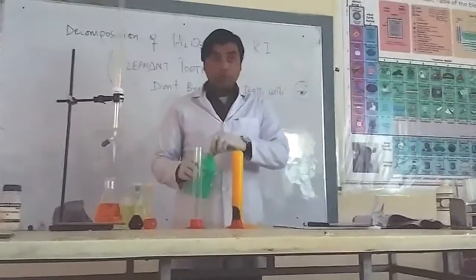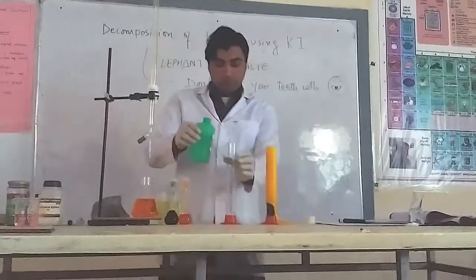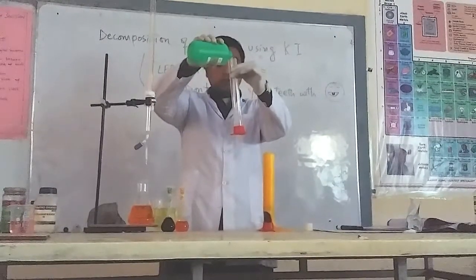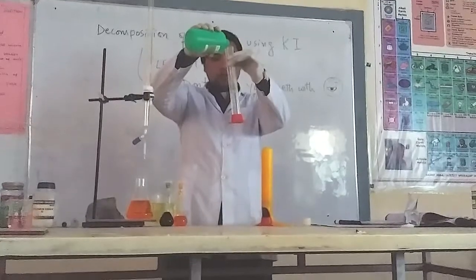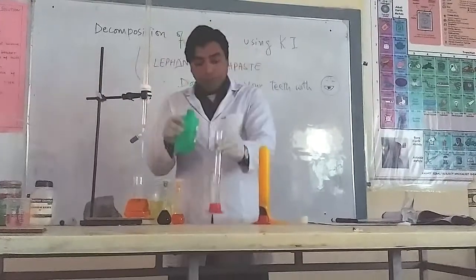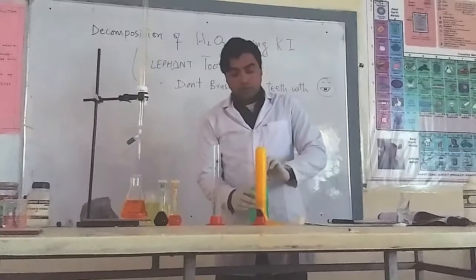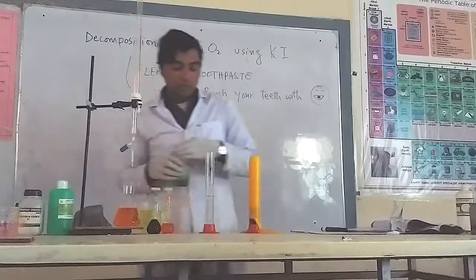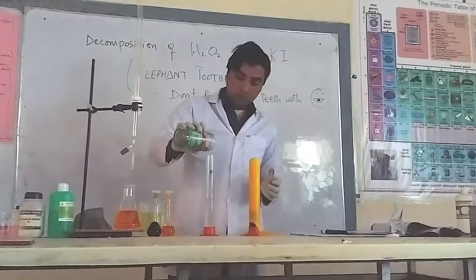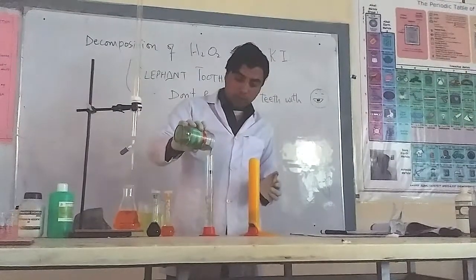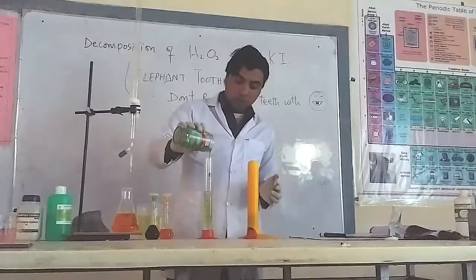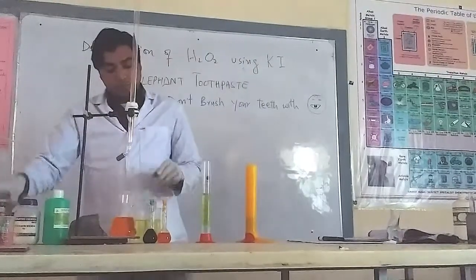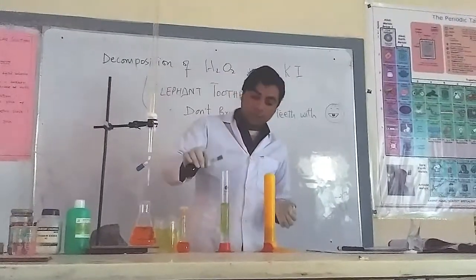We will now repeat the same experiment with yeast. Once again, we take 60 ml of hydrogen peroxide and add water. We will do better this time.